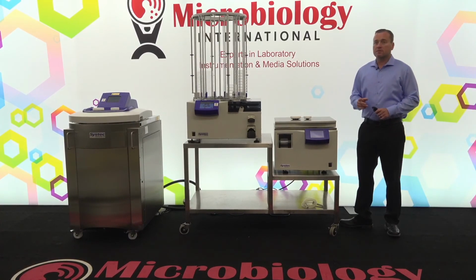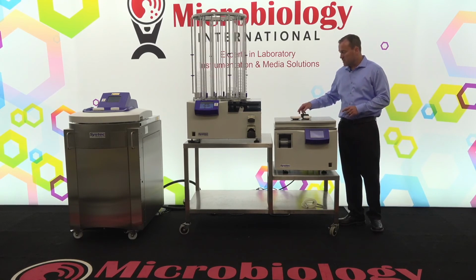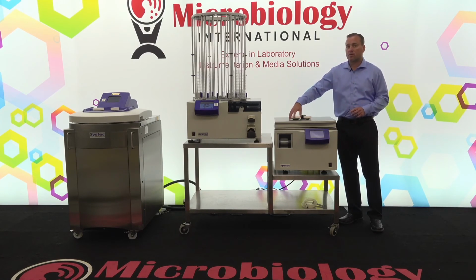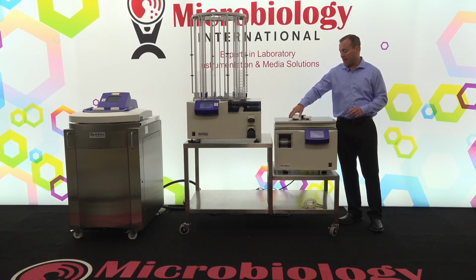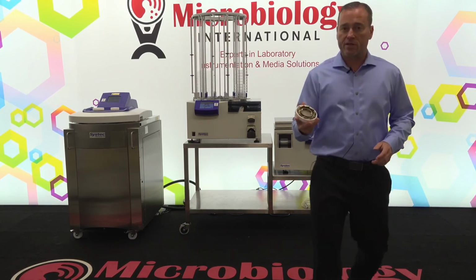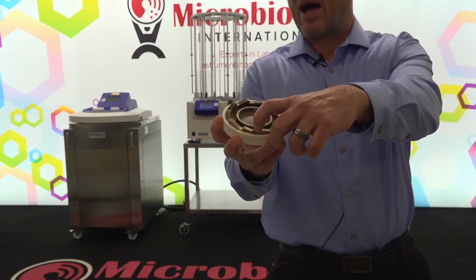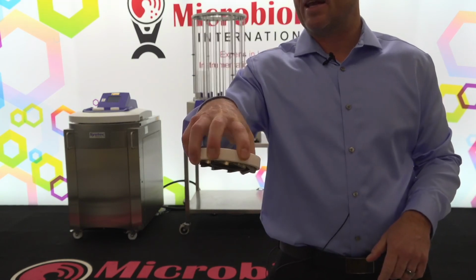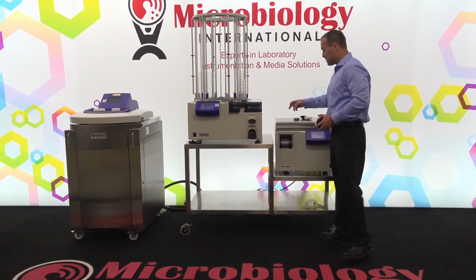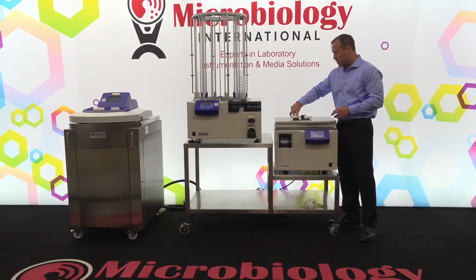One thing that I think I failed to mention is the caps that are on the top of the MediaPreps are locked by a locking pin that is located in the back of the instrument. So each of them have these various teeth on the top of the lid that the locking pin will lock into these positions. So this lid cannot be removed during any type of cycle because the locking pin will move into position and lock this down, so we cannot move that after the cycle has started.